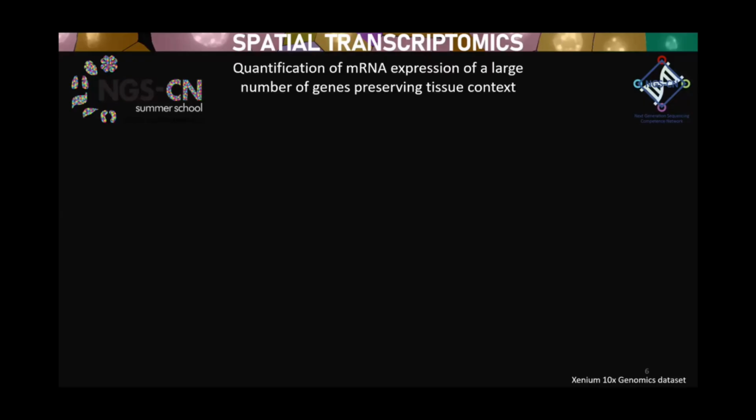So what is spatial transcriptomics? This is a group of methodologies that allow the quantification of mRNA expression of a large number of genes, at the same time preserving the tissue context of the gene expression.